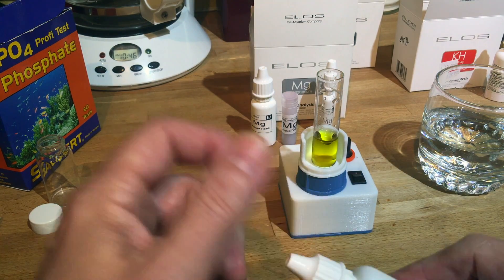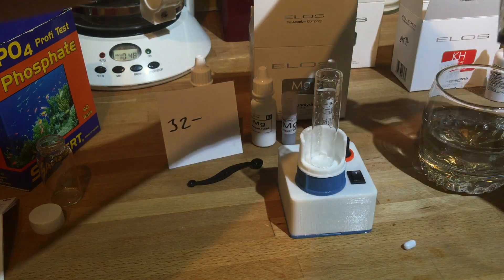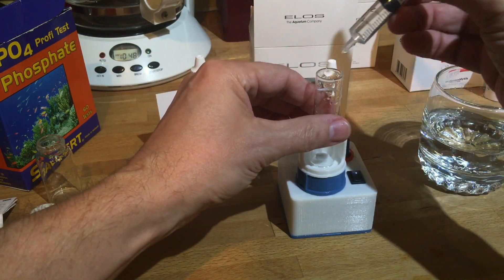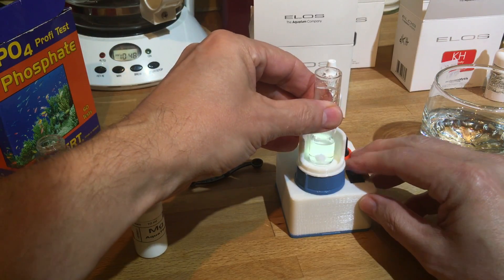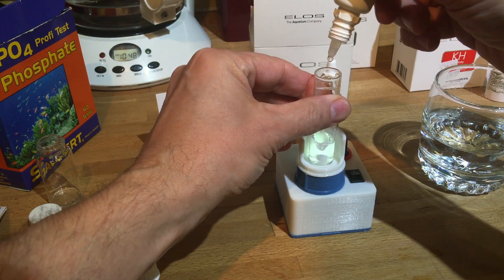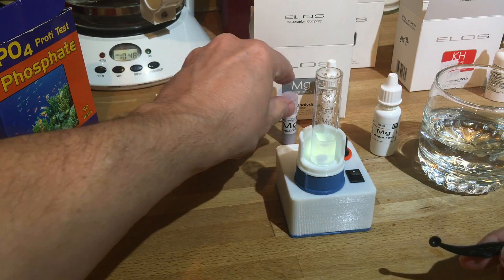Thirty-two drops. Were you keeping track for me? Alright, thirty-two — we just have to remember that number. Gonna dump this out and add three more milliliters, and our little stirring bead. Now we need five drops of B, then add the powder, and turn this on again. Here's our five drops and a tiny scoop of part C.